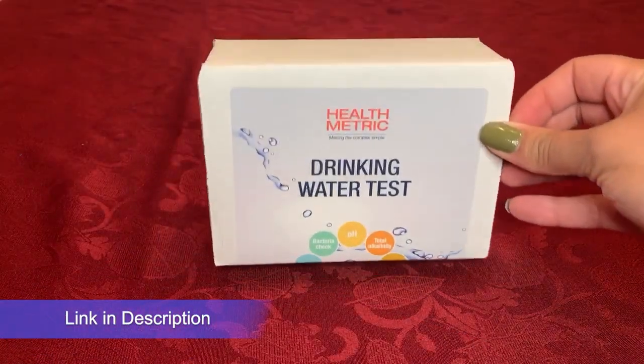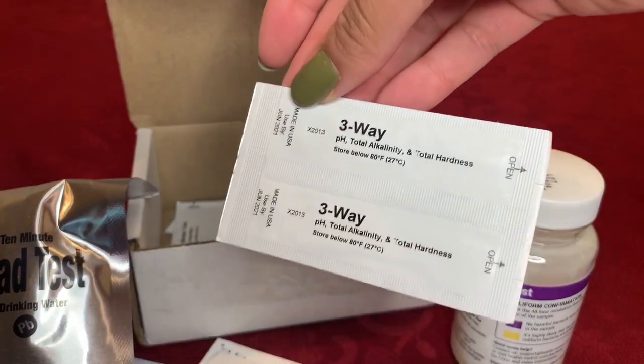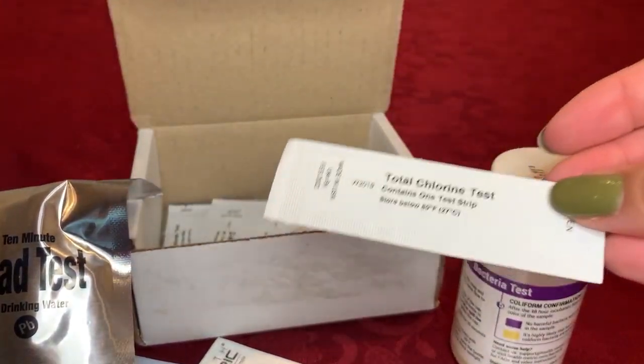Hey y'all, today we're going to test our water. I ordered this Health Metric drinking water test, and it's said to test your pH, bacteria, total alkalinity, copper, lead, nitrate, nitrite, total chlorine, and total hardness. I think that's pretty all-consuming, especially for the EPA drinking water safety regulations. So let's check it and compare it in relation to what I find for my city water.